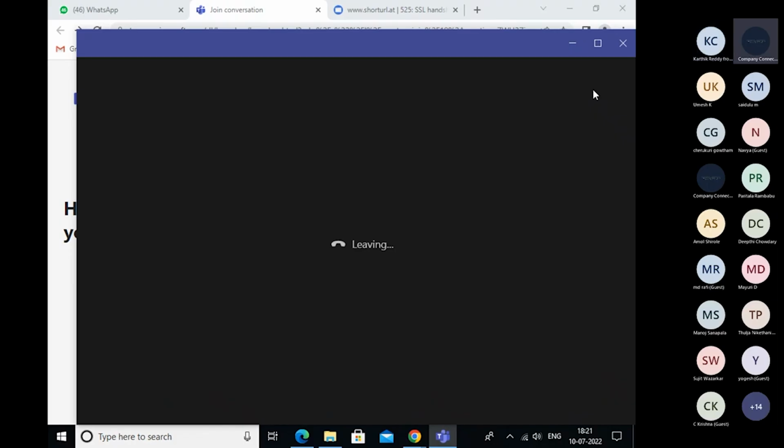Are you sharing your screen? Sir, we are not able to see your screen from the last 2 minutes. I think someone else has shared, isn't it? Oh, sorry. Please wait.